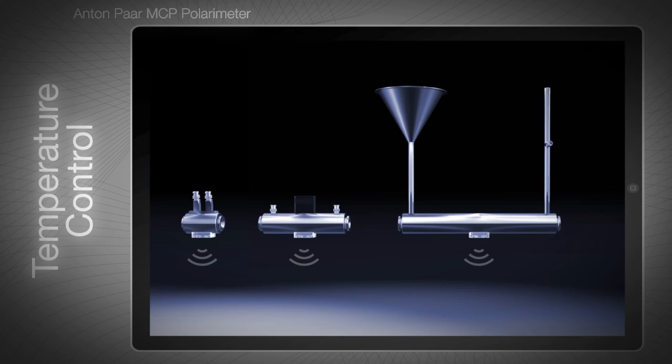The intelligent MCP sample cells do not require batteries or external power for measuring and transmitting the temperature. Thanks to the wireless technology, they are sealed and waterproof. This makes them resistant and ready for a long life in the laboratory.